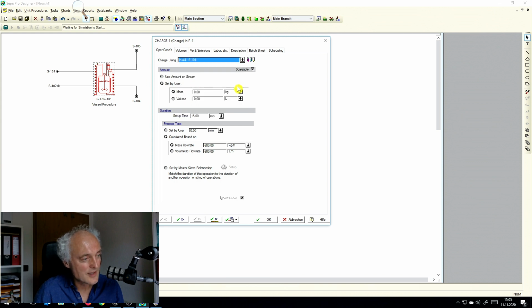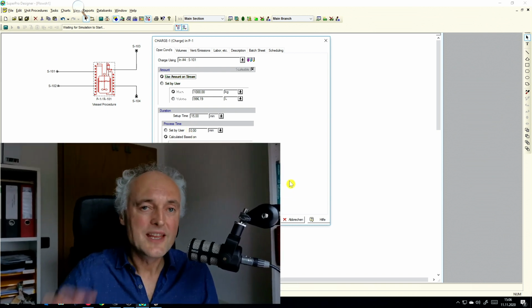That's it. And then you remember we have initialized the stream. So the amount we want to charge is the amount which is given in this stream. So everything was written in the stream. So we click here, amount, use amount of stream. And then everything is fine. The remaining part we leave untouched. So the setup time and so on, we keep.